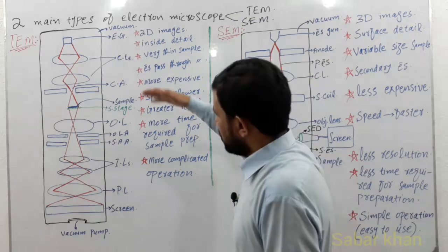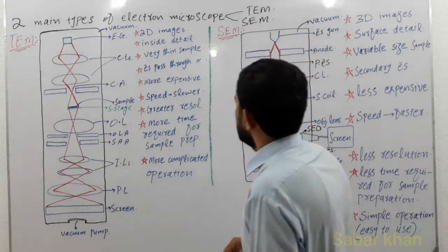So this is the transmission electron microscope.